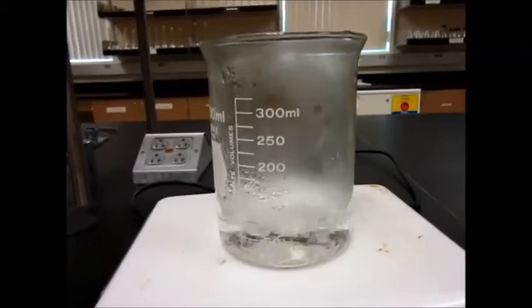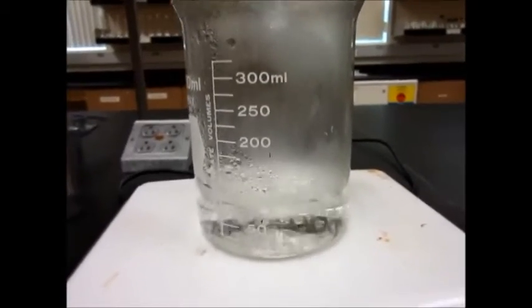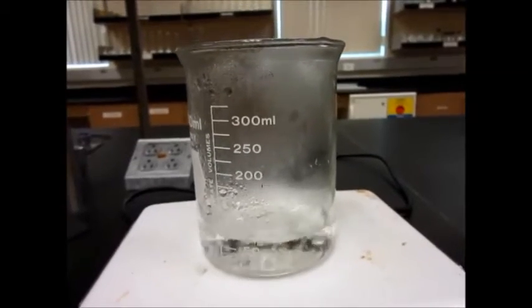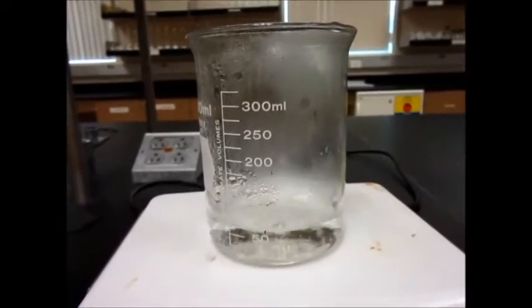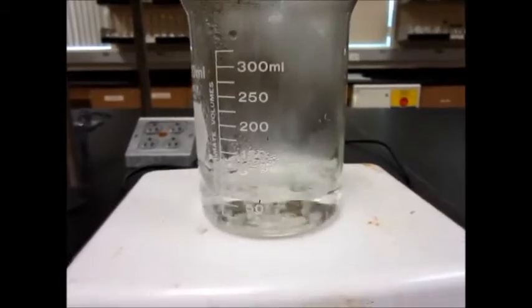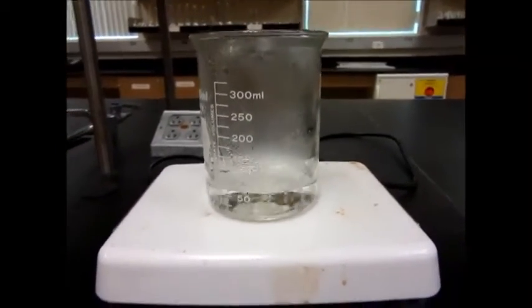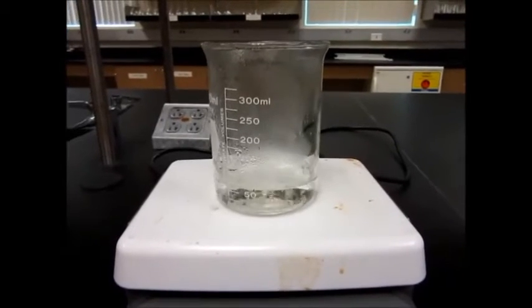Here is the water boiling now with the boiling chips. If the boiling chips were not there, you would not have this kind of even boiling — you would see huge bubbles of air coming out, and those can actually hurt you. This kind of even boiling is good, and it happens only because of the boiling chips. So don't forget the boiling chips.